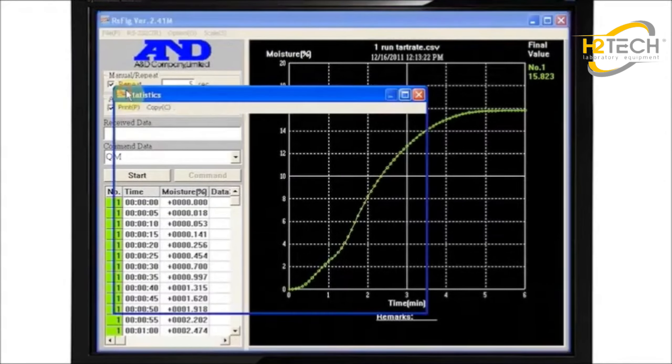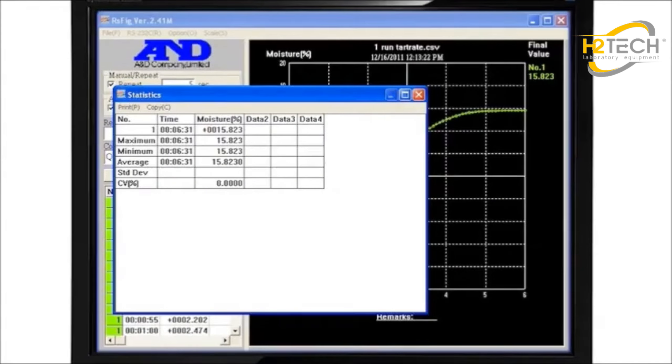Finally, WinCT calculates statistics and saves data as an Excel file.